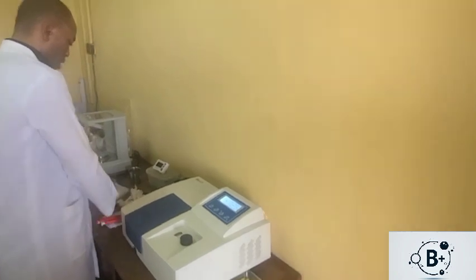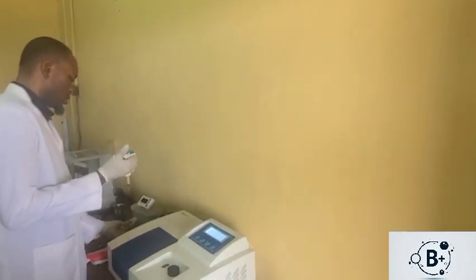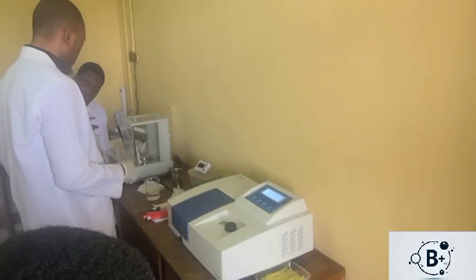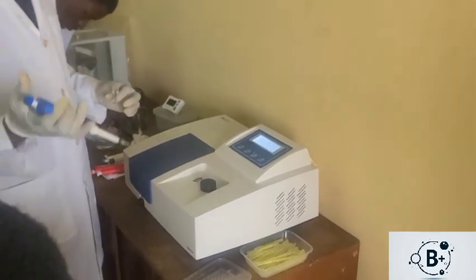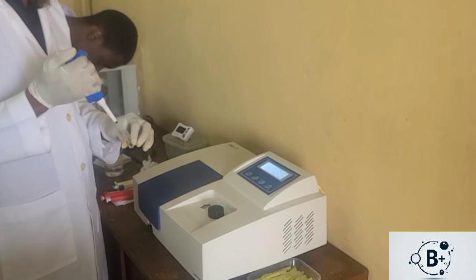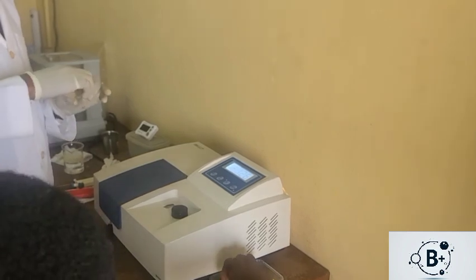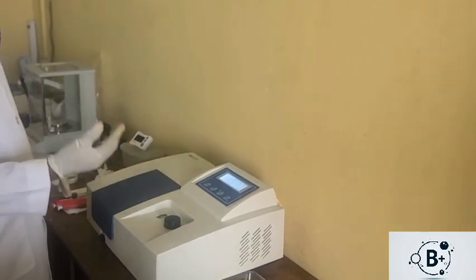Now I add the GSH reagent, the second reagent, the reduced glutathione. Then we add the phosphate buffer to it. Then we add the test sample last, that will be added to this composition. Then we have it inverted this way and now inserted. Ensure the cuvette is handled properly. So we fit it into the cradle and we start the reading at 0.